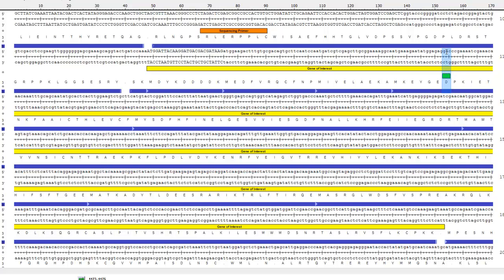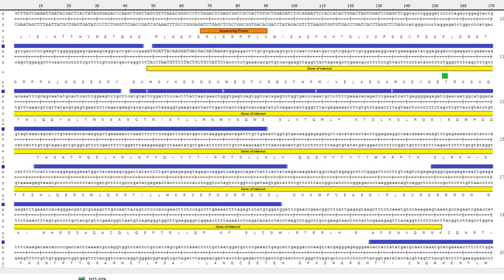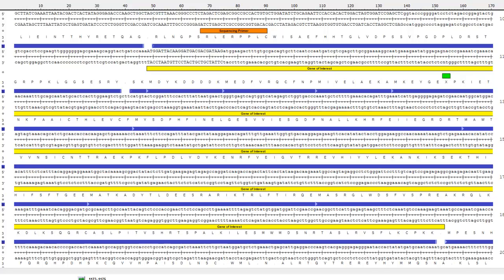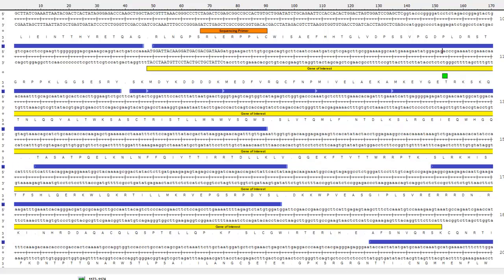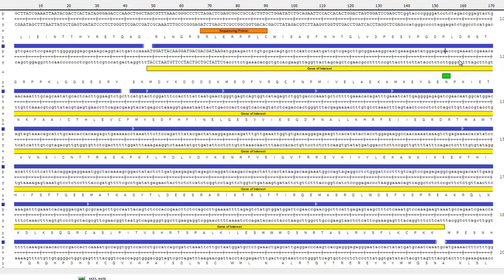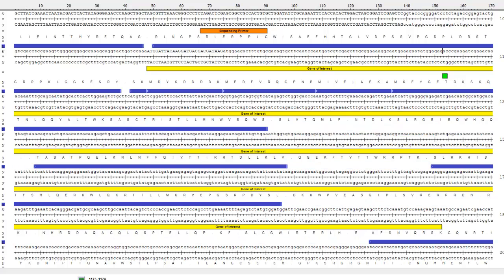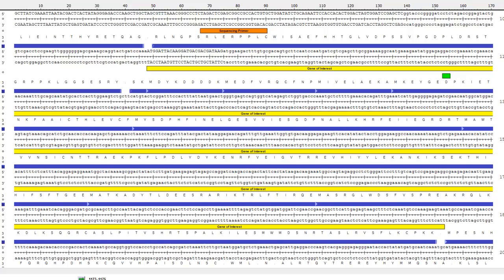So just to prove that, I'm going to delete this G here, and then we're going to put in an A. Sorry, not N. N is the amino acid, so we'll put in A. There we go. So we put in A, and now we have an N, which is the asparagine. So we'll just go ahead and change that back. Now we have the regular GAC instead of AAC for aspartic acid.